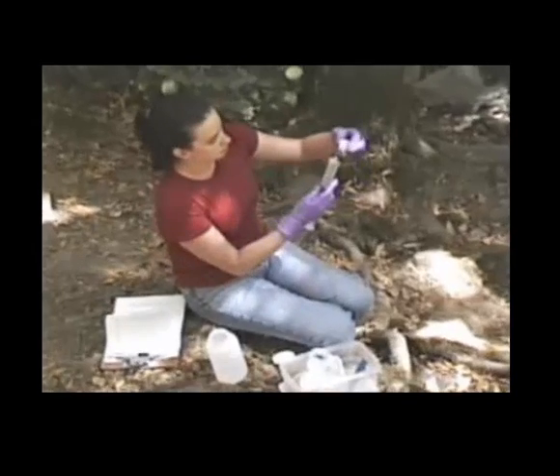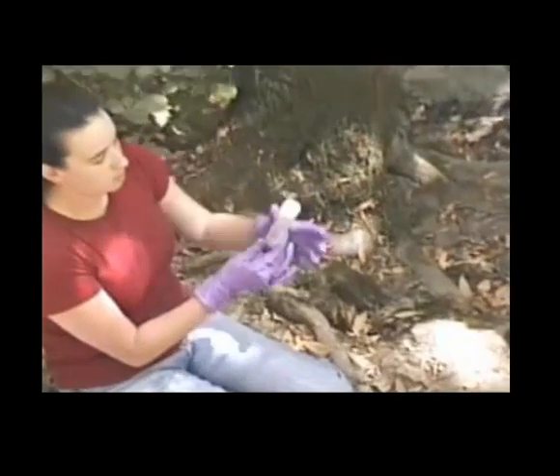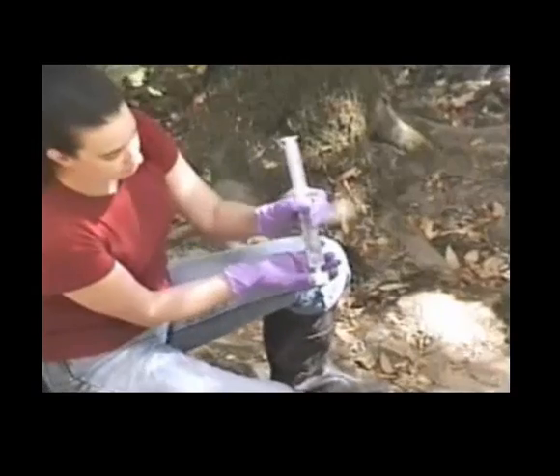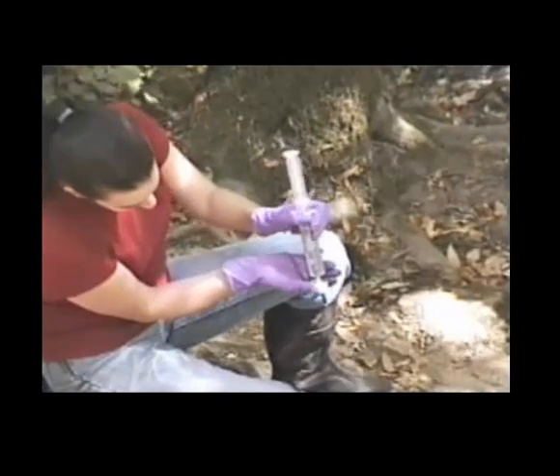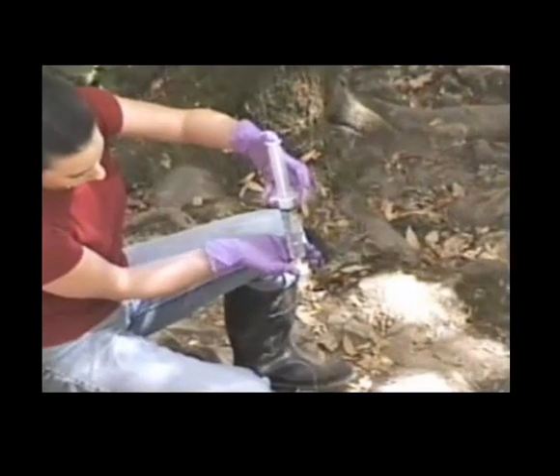You put the filter in, and you want to make sure that as you're dispensing the water through, you carefully hold it in place, and then you slowly disperse the water.